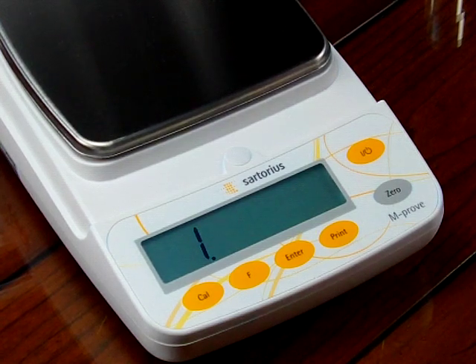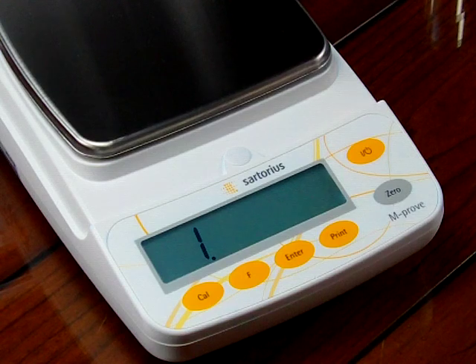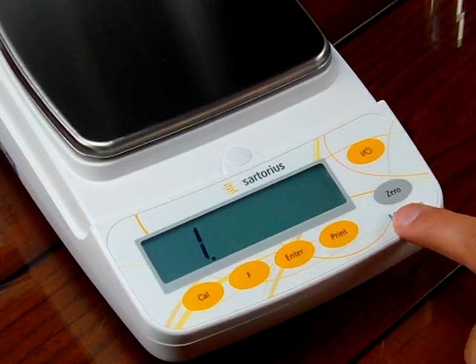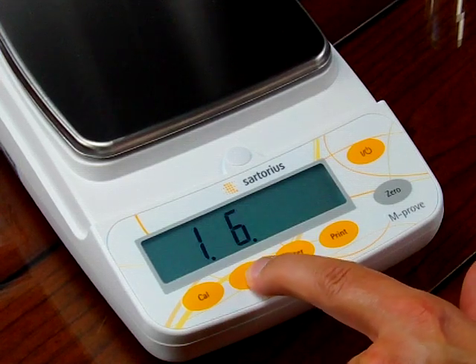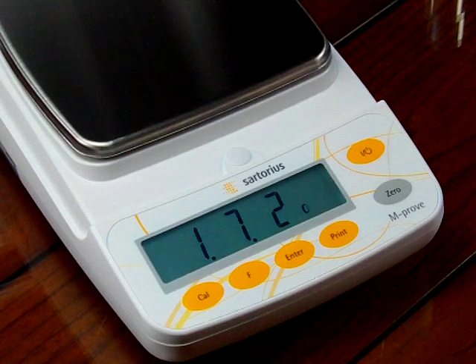If we want to change the weigh mode so that the primary mode is carats, we need to enter code 174. The manual doesn't really specify these codes — we just know the balance well enough to know them. Right now we have a one there and we need to change it to 171 first, moving the decimal place over. We press the enter key to get 11, then press the F key to increment to 7, press enter to move over. Right now it shows 172, which is grams as the primary mode.